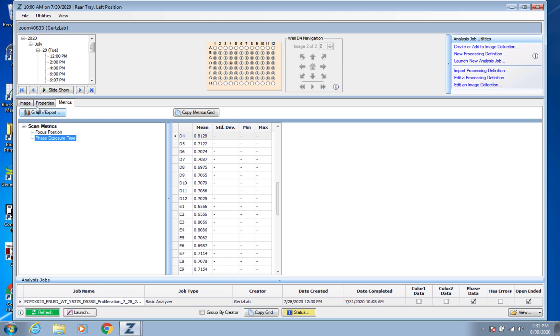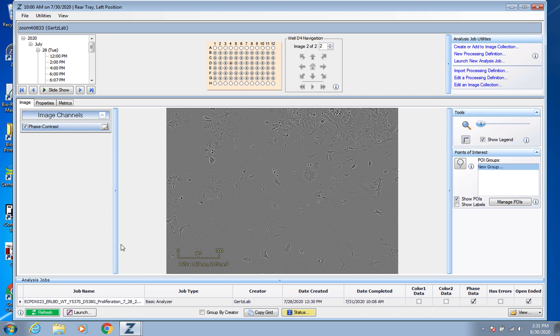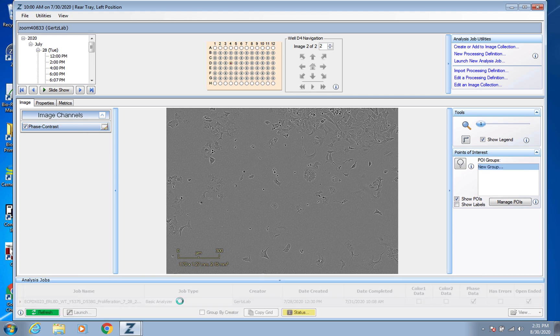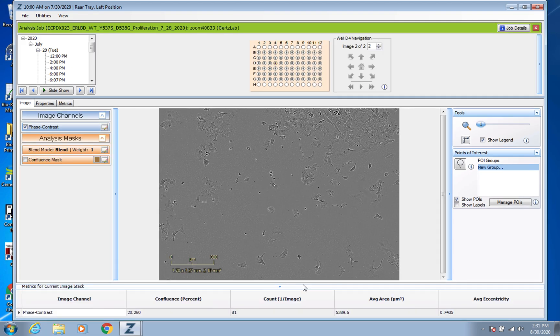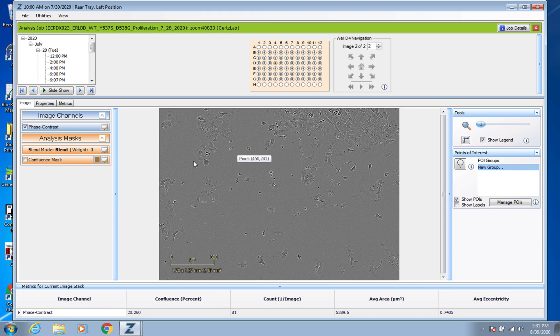So what you want to do is go down to this Analysis Jobs, you should have it here, and just double click anywhere along that and it should come up like this.